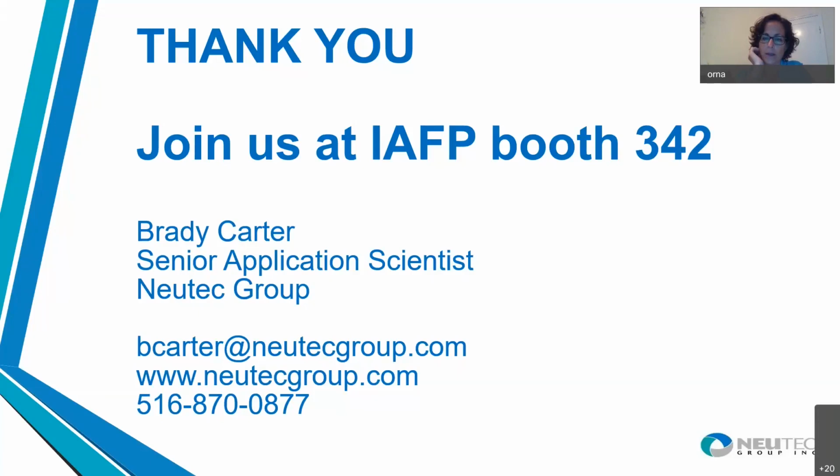Nope. So hopefully, if you remember back to the presentation, they measured moisture content, but they switched the methodology they were using. So there was an error introduced in their moisture content measurement method. It was still measuring 10%, but in reality it was 12% because the method was incorrect, and it wasn't giving the same results. So it was saying 10% on the screen when in reality the moisture content of the product was 12%. And so that water activity with 12% was higher than 0.7, whereas at the real 10%, which is what they had been measuring before, it was down at a lower water activity.